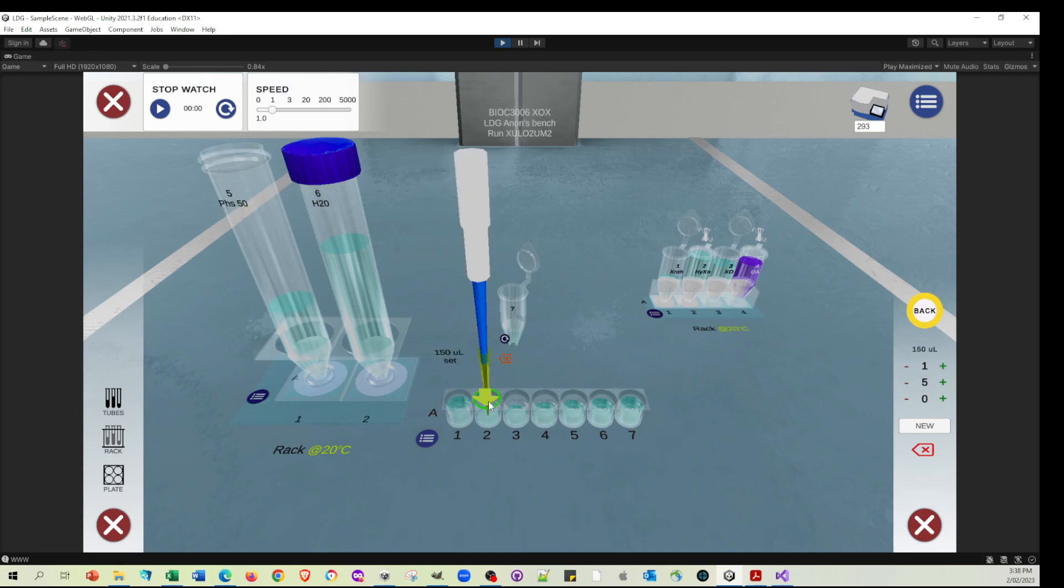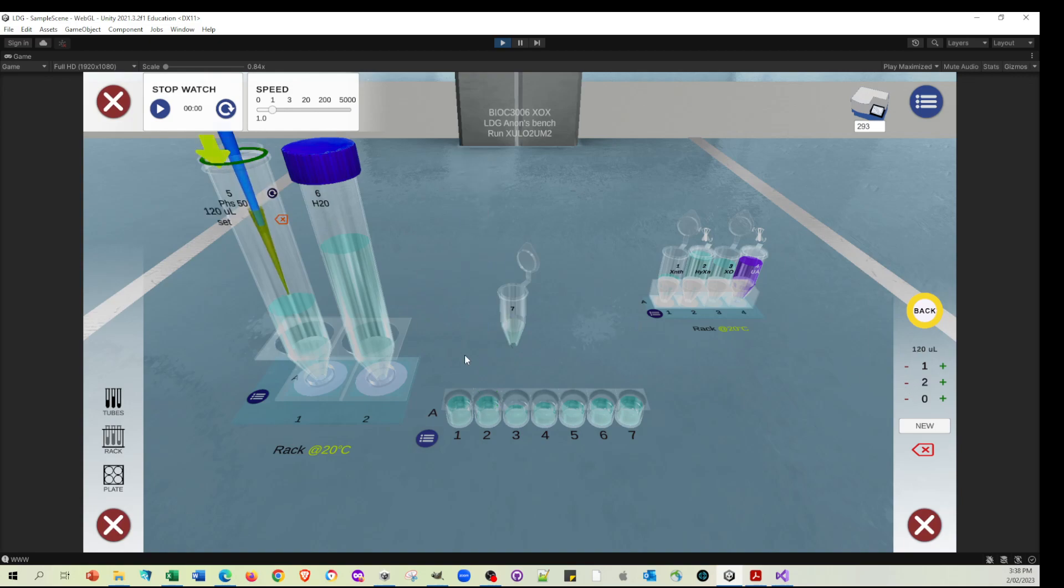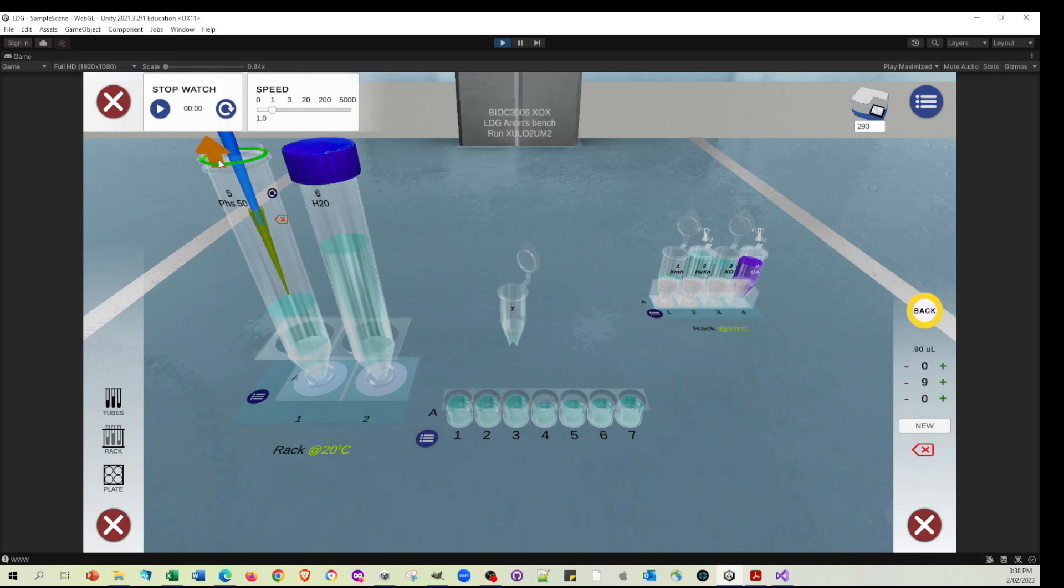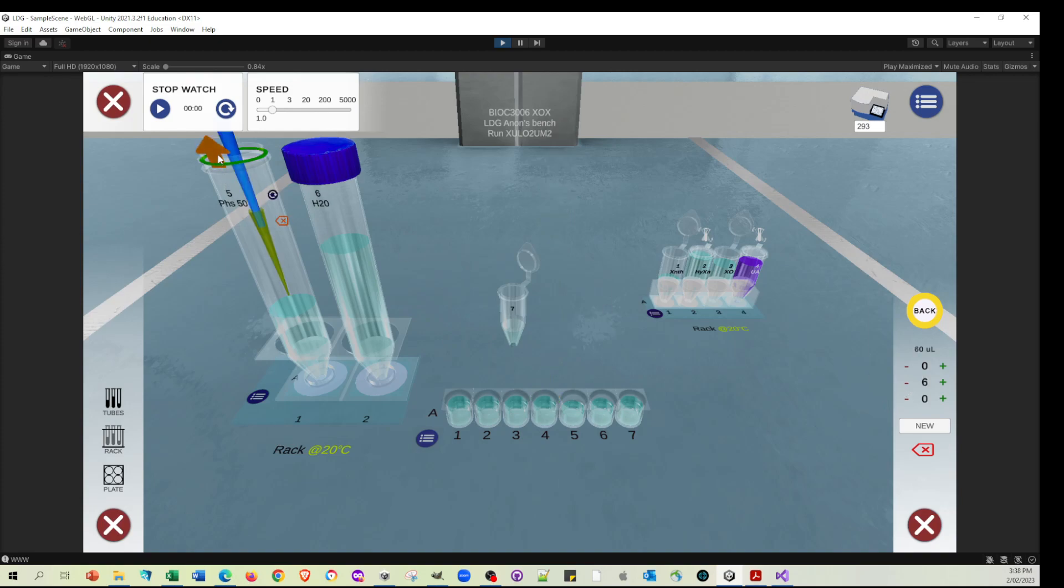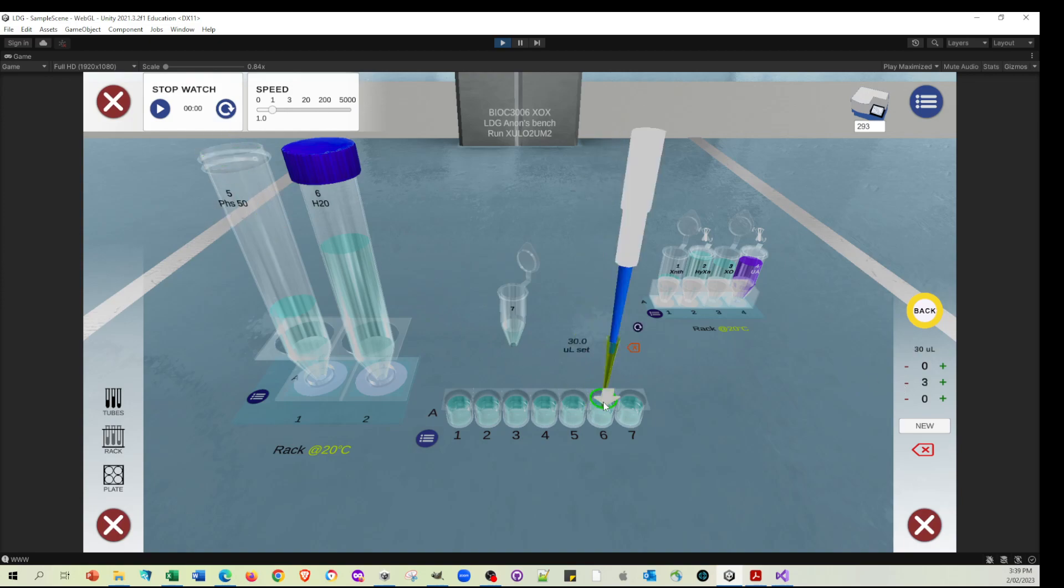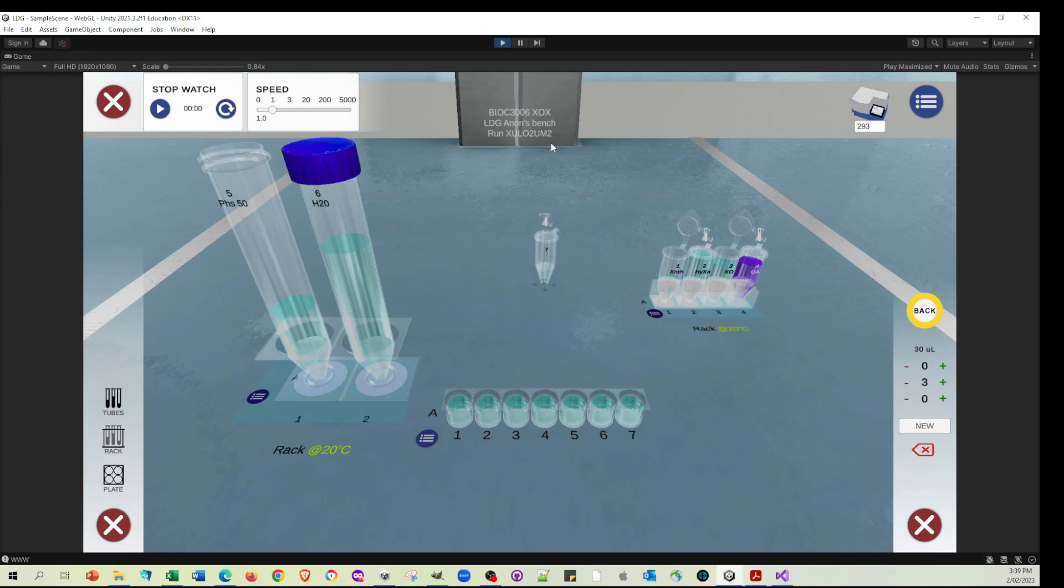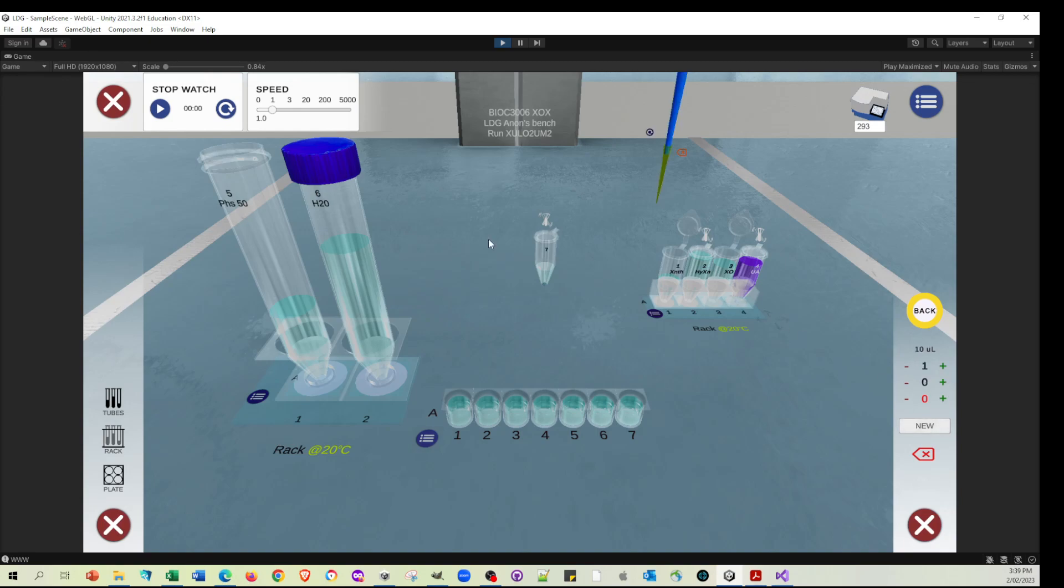150 in the second one, 120 in the third one, 90 in this one, 60 in this one, and 30 in the penultimate one. Of course, the very last one has already got 180 in it. So to start the reactions, we're going to add 10 microliters of the enzyme. Let's start that one off, start the stopwatch.